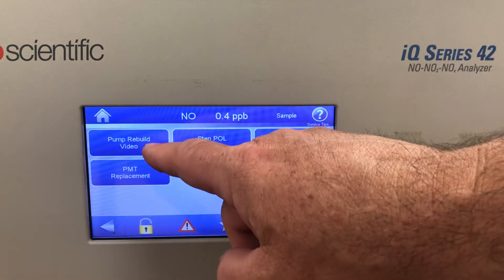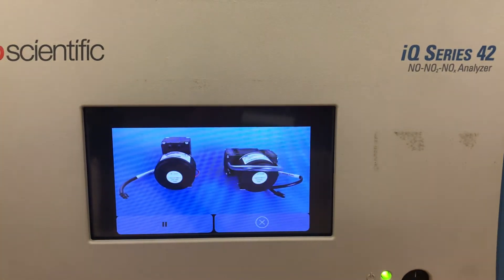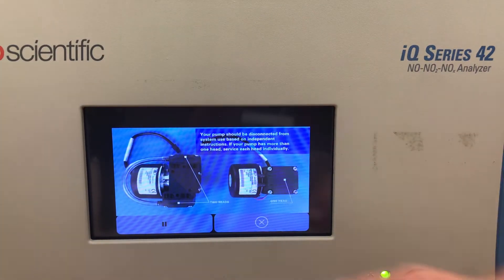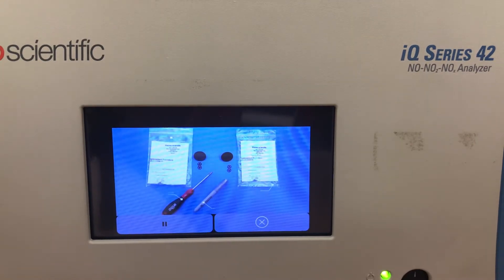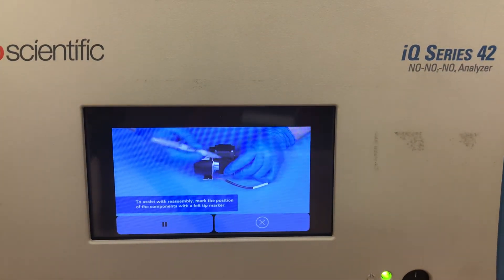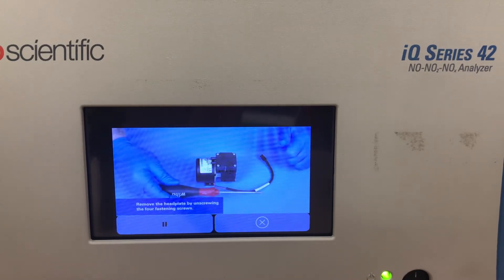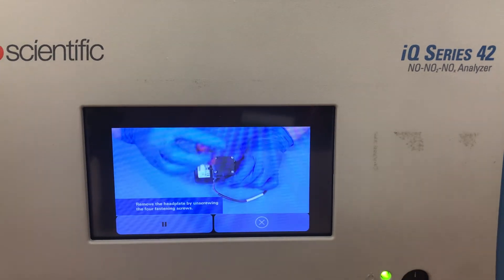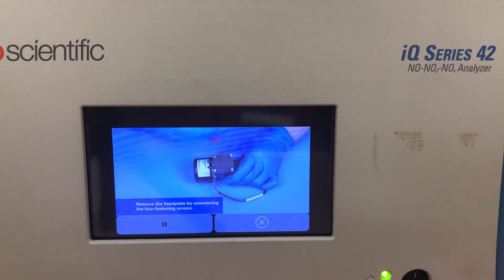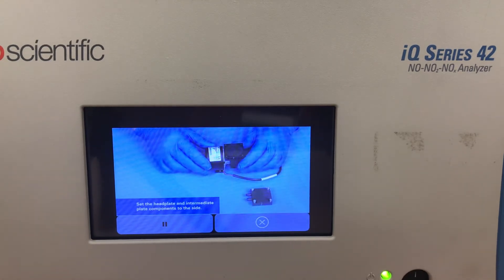It also has a pump rebuild video. When I touch that, the video starts, explaining on this NOx analyzer how to change the pump diaphragm. It starts with a view of the pump from left and right, gives text, and shows arrows pointing at different parts. It shows the pump repair kits, part numbers, and recommended tools. Then it shows someone actually disassembling the pump head, marking the orientation, removing screws step by step, taking off the top of the pump, and revealing the diaphragm underneath. It's a great visual maintenance tool.